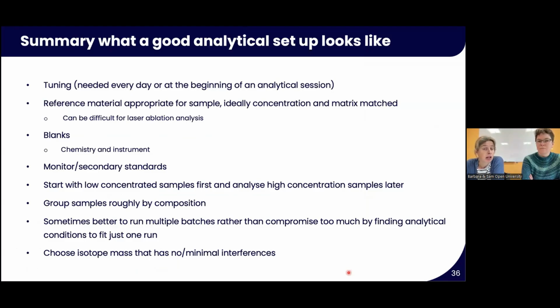We should be measuring blanks. We should be looking at chemistry blanks, and we should be looking at instrument blanks throughout the run to make sure that the instrument isn't getting dirtier throughout the run that we're doing. We should be looking at using monitors that are run throughout the analytical session or looking at secondary standards.